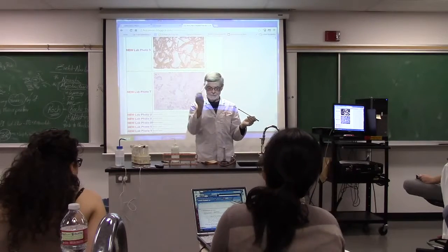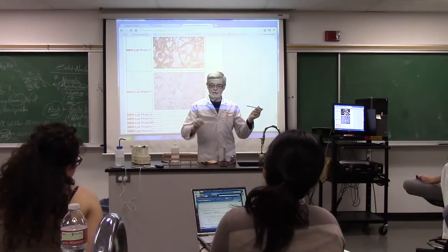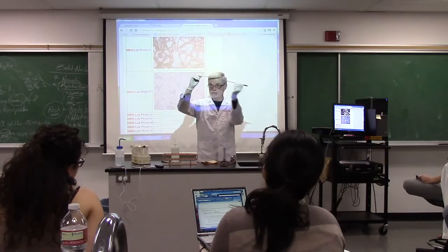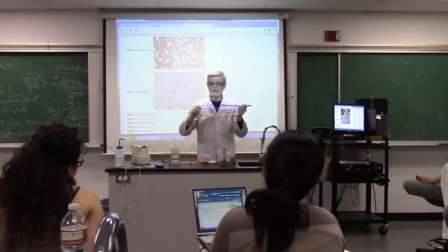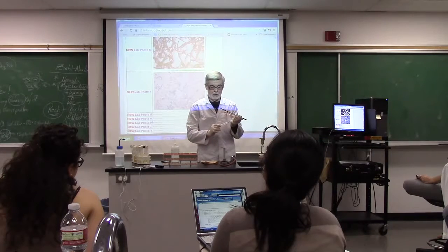Remember, hold it by this. Grab it with your little finger. Go downhill. Okay, now notice this is uphill. You're always going to go past half. Don't pick up at the beginning of the tube, a little bit past half. And remember, when you're stroking this like someone's hair, this is going to be kind of scabby. So it's going to be kind of hard.